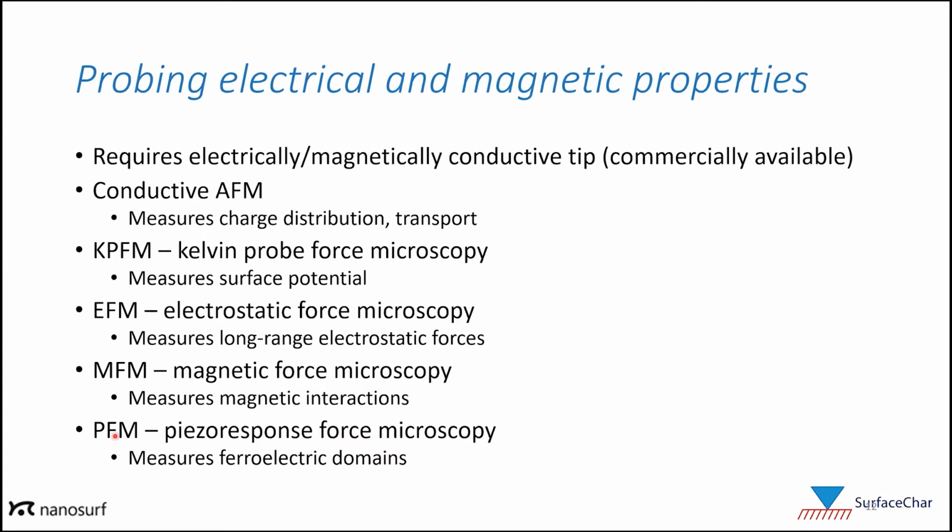Just a quick note on PFM, reflecting the alphabet soup of modes that is the AFM world. It actually stands for multiple modes. PFM can also stand for a mechanical mode called pulse force microscopy.